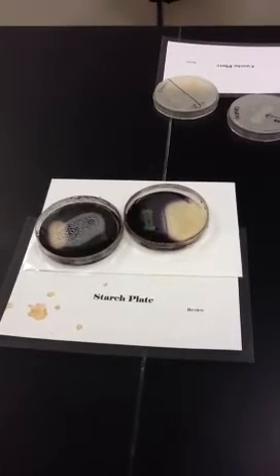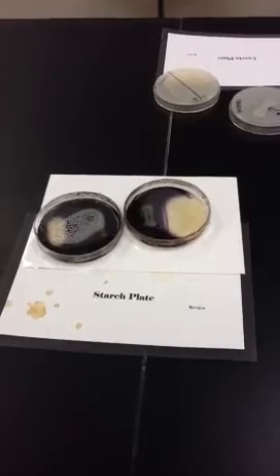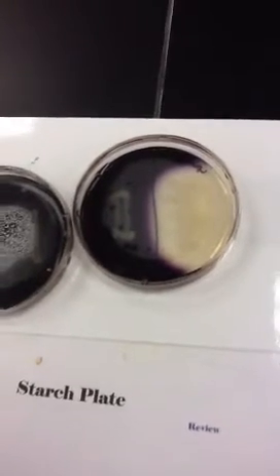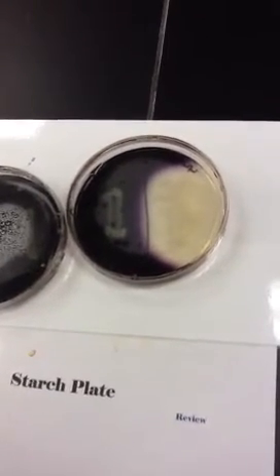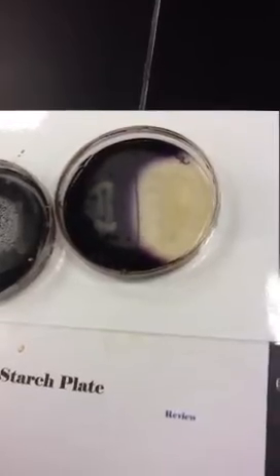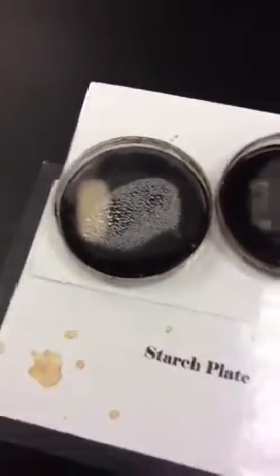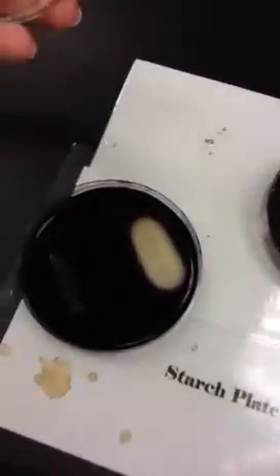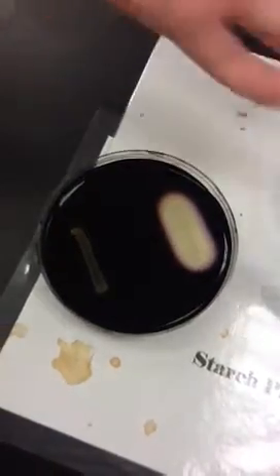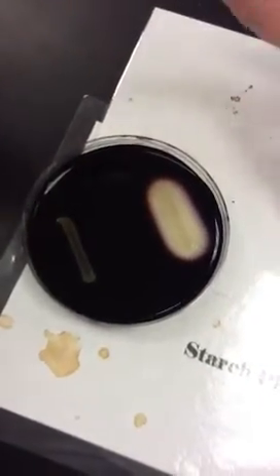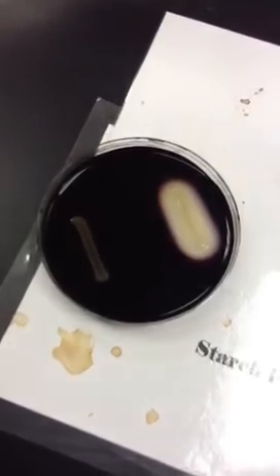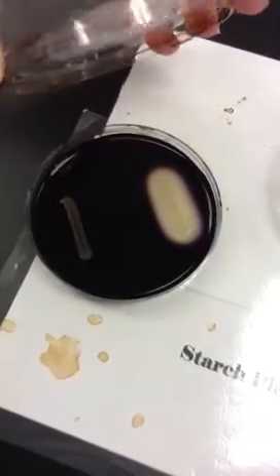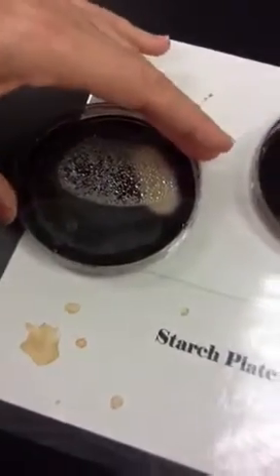This is not... This has to do with amylose, not DNA. Amylose? Amylase. Amylase and amylose, yes. Okay. So when it has a clearing like that, that means... It's positive. It has the enzyme that it has amylase, which can break down amylose and starch. Okay. And this one was obviously... This one's positive, too. It's just a different one, look. Oh, okay. Around that one. Oh, that's a good picture. So this one's positive? They're both positive, actually, but that one's positive on that side, that one's positive on this side. They're just two different samples. Okay, so the other one has a clearing, it's positive. It has a clearing, it's positive. And then obviously the other organism is negative because there's no... Correct. Except for just the streak. Correct.